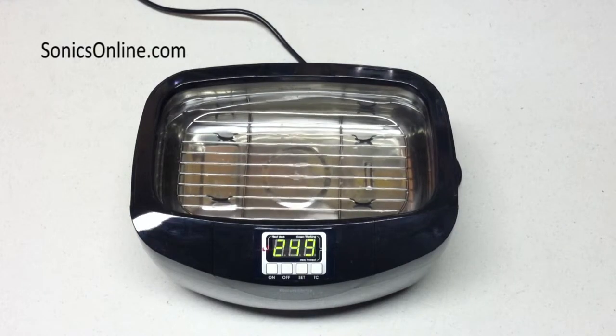The time you need will vary depending on your tank size and the power level. Simply fill your tank with hot water or run the heat to get it up to cleaning temperature, then turn on the ultrasonics just as you would for cleaning.